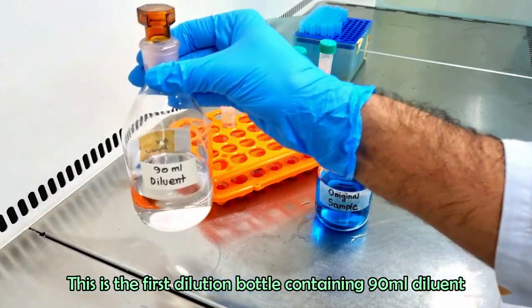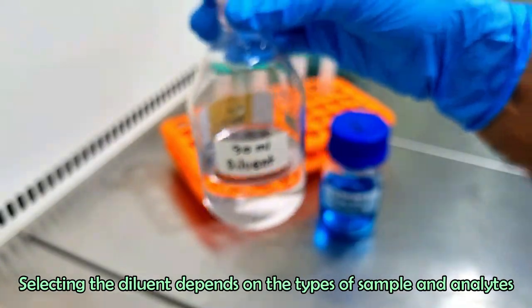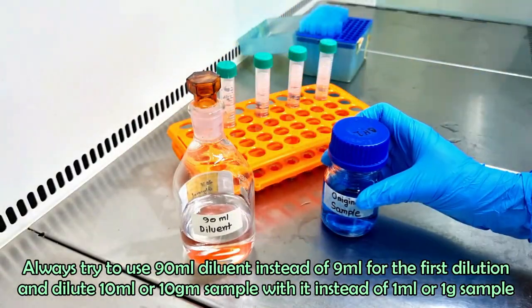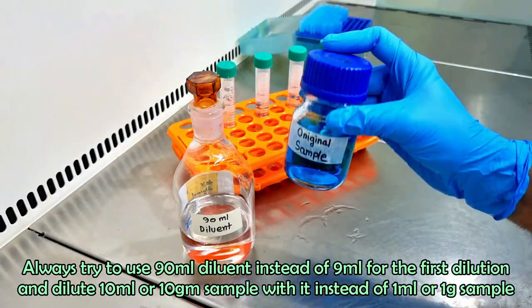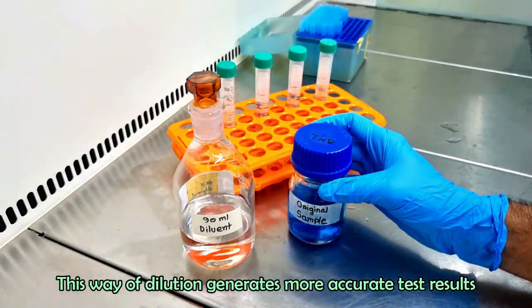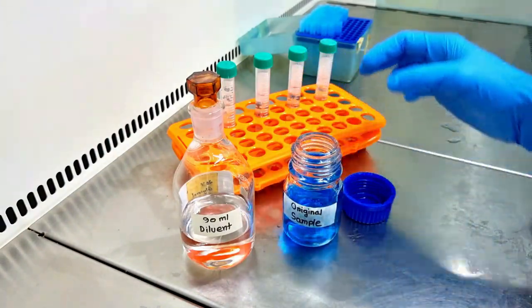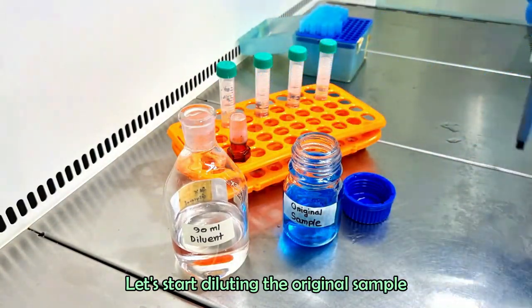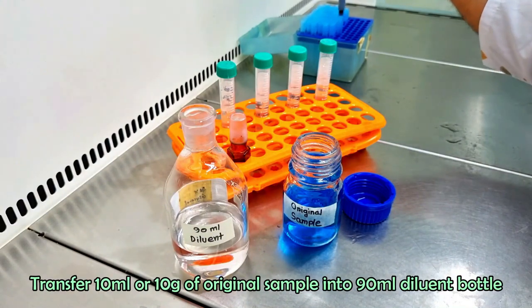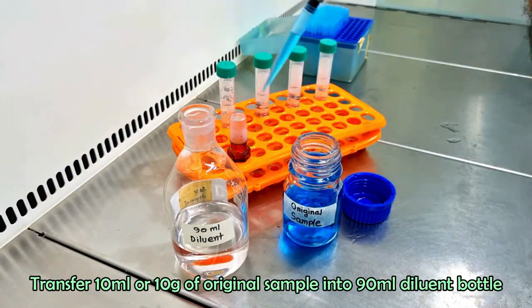This is the first dilution bottle containing 90 ml diluent. Selecting the diluent depends on the types of sample and analytes. Always try to use 90 ml diluent instead of 9 ml for the first dilution, and dilute 10 ml or 10 gram sample with it instead of 1 ml or 1 gram sample. This way of dilution generates more accurate test results. Transfer 10 ml or 10 grams of original sample into the bottle containing 90 ml diluent.